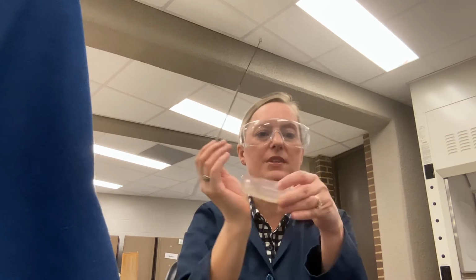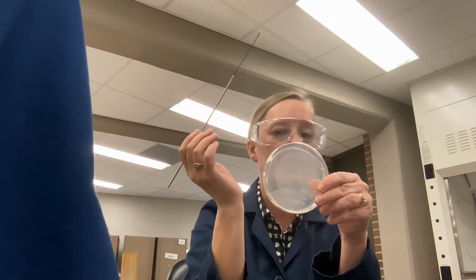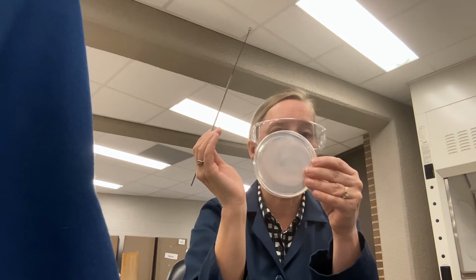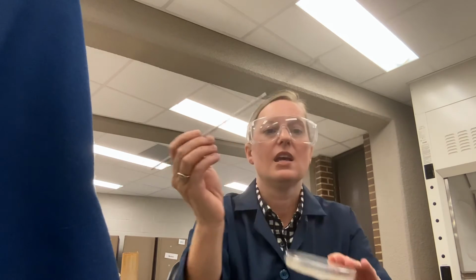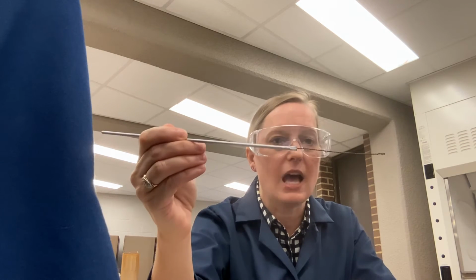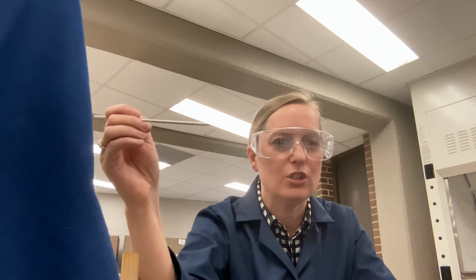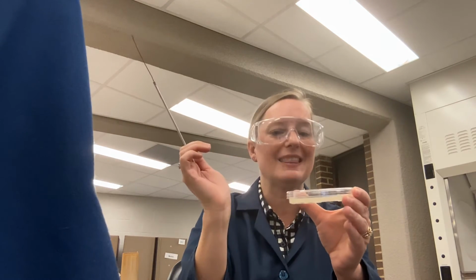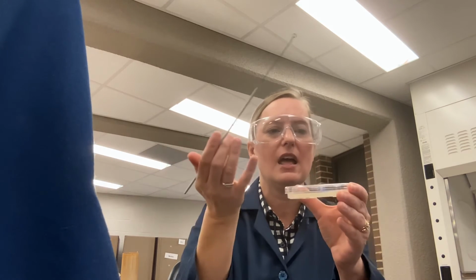It's important to keep this lid as closed as possible so that we don't introduce contaminants. So at the end of this demonstration, I will actually take the lid off, which you're never going to do, just so you can see the streaks on my plate. As I'm doing this, the loop is parallel, flat, with the agar. We're not going to tip it on its side, otherwise we'd have these huge drag marks. It's also important we do not want to streak the lid. There's no bacteria on the lid, there's no nutrient agar on the lid, nothing would grow.